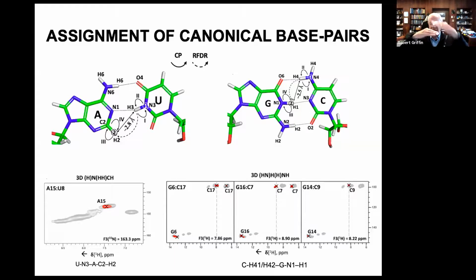I was thinking about the stacking, the vertical stack. Oh, they are even further. They are 4 point something. This we tried quite intensively, and we also tried with selectively labeled nucleotides, with RNA selectively labeled at individual positions in order to eliminate all possible dipolar truncation and whatever. With T-DOR, we were never able to see anything. I think we were able to see something through a proton-driven spin diffusion experiment. Let me recall that. We never even published it because of all the stacking. We saw maybe 1 or 2 of the positions we tried, but they are far, 4.2, 4.5 angstrom.